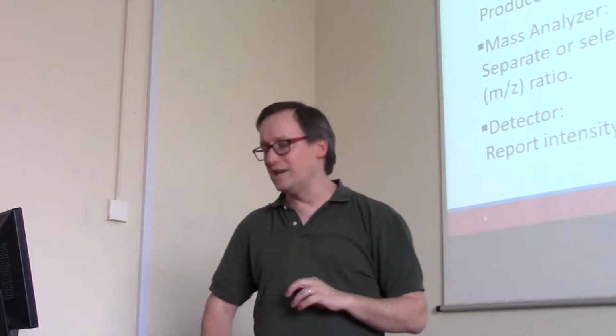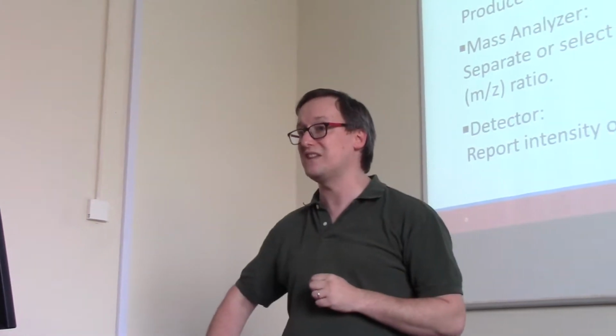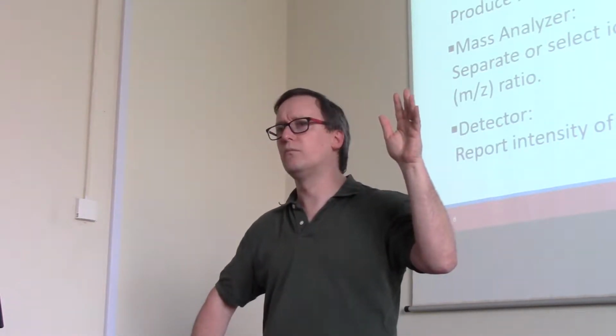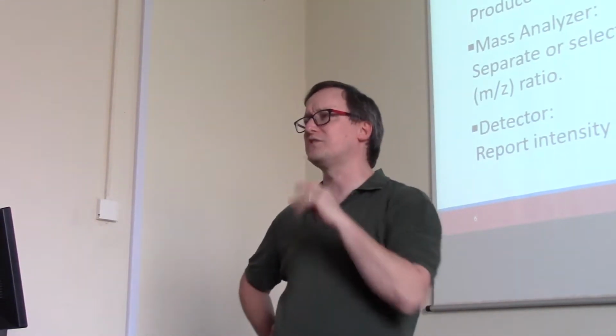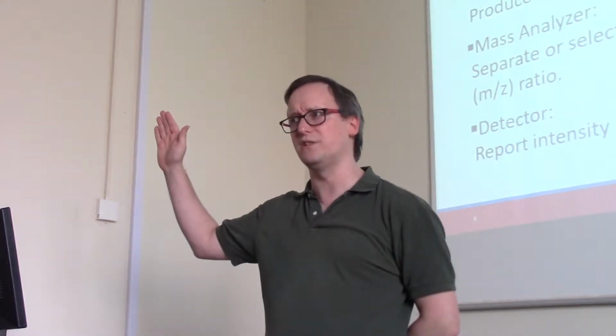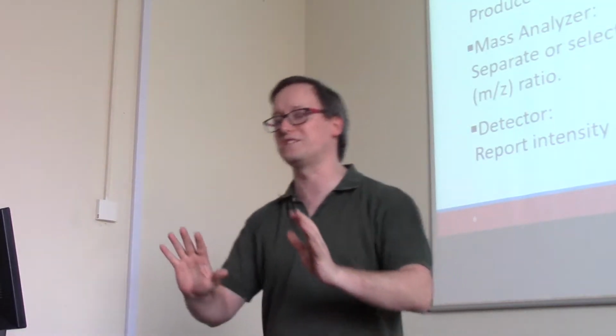Now I've already used the word analyze a few bazillion times, and sure enough, the next part of the mass spectrometer is a mass analyzer. There are a whole slew of these. Does everyone know how a TV works? One of the first types of mass specs we used was called a sector, and it bears a little resemblance to your TV. So this is before we had all the flat screens. Does anyone remember the old tube TVs? Good, I'm glad people remember the tube TVs. All right, I don't feel old just yet.